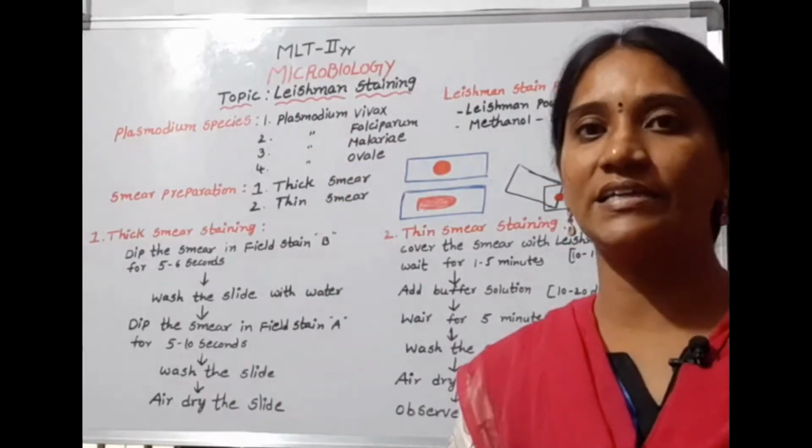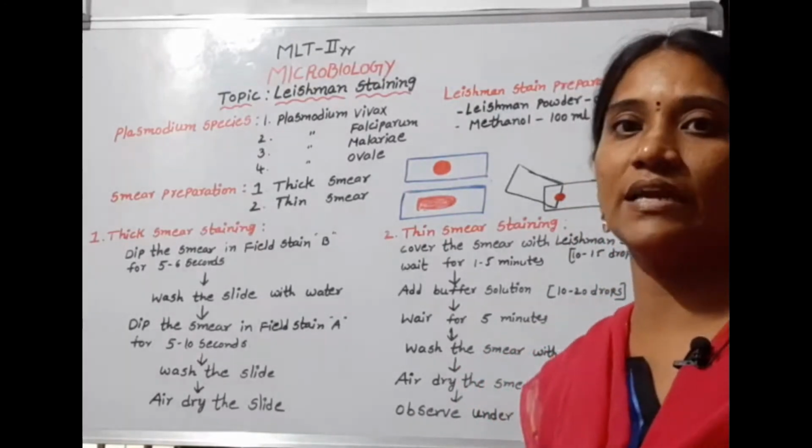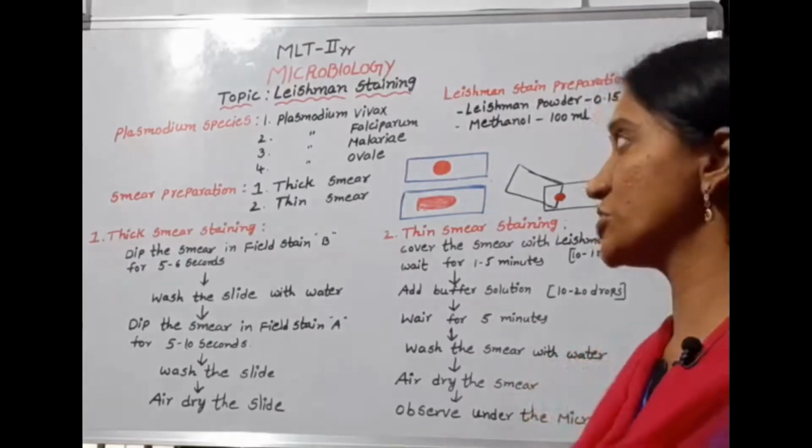Leishman is the scientist's name. He introduced the staining technique, so it is called Leishman staining.